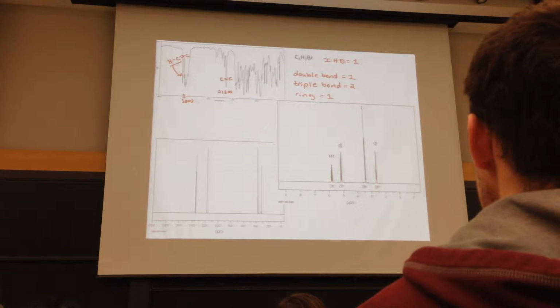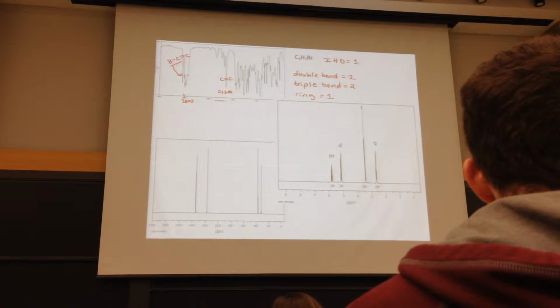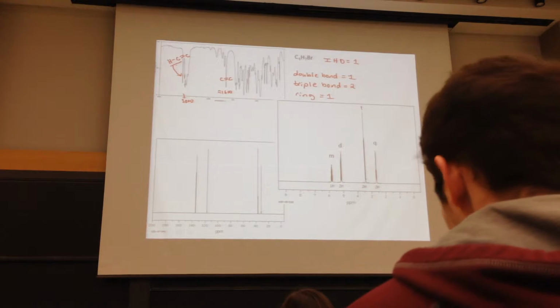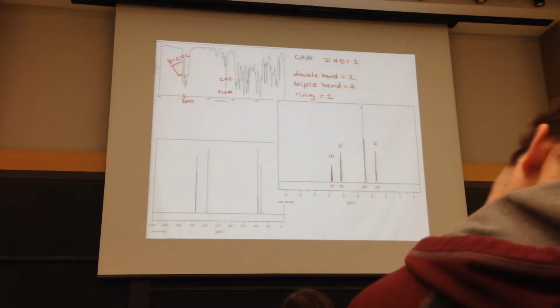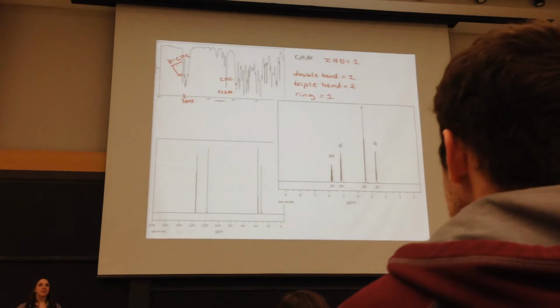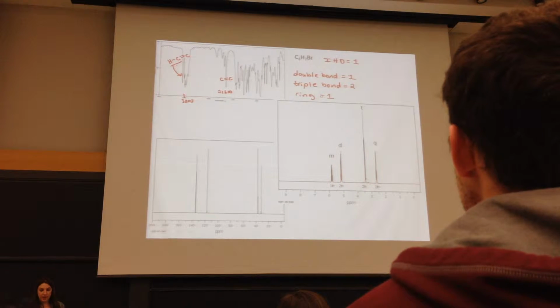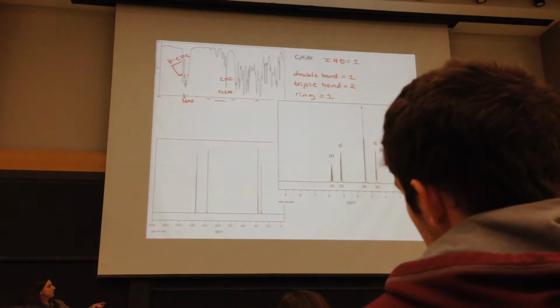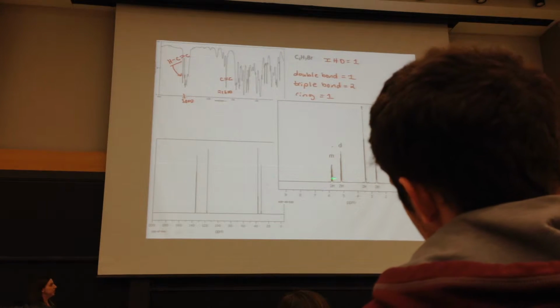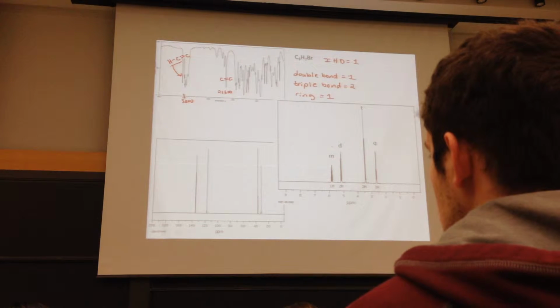This is when you would turn to table 13.3. So proton NMR. If we go through and find a hydrogen that is vinylic, coming directly off of that carbon, it tells us we are in the 5 to 6 range. So we know that these two signals are in the vinylic region. How many total hydrogens do we have coming off of this double bond?